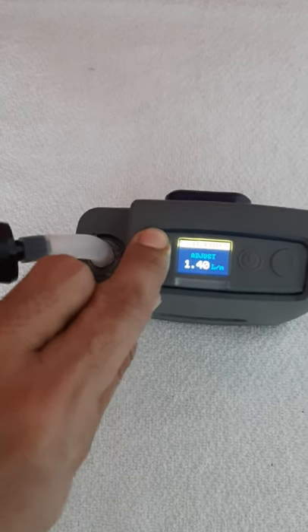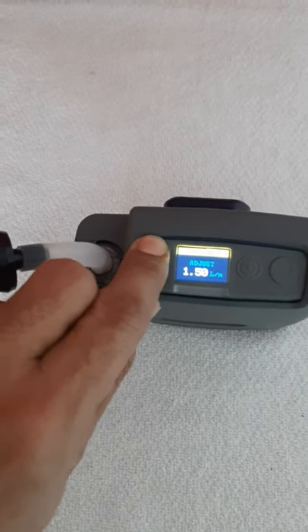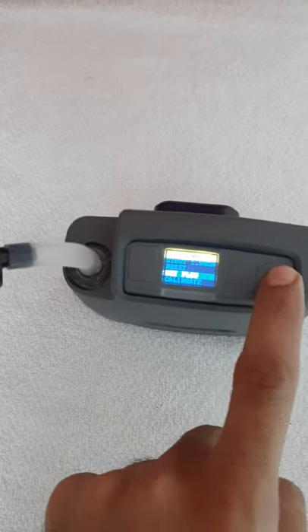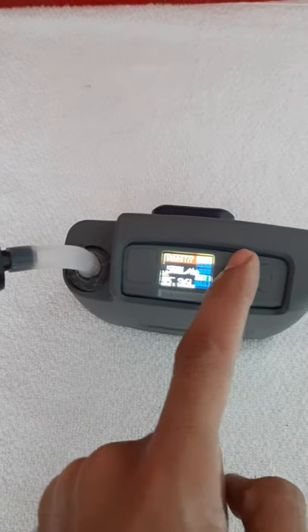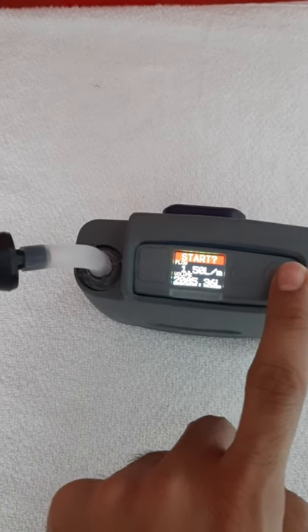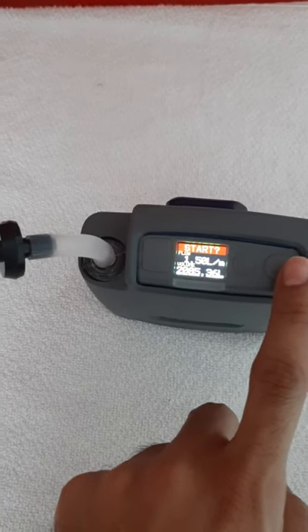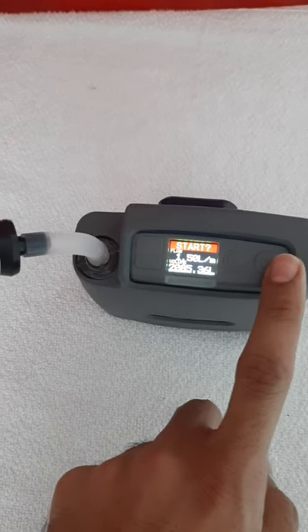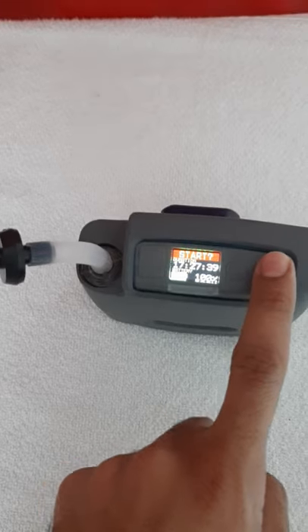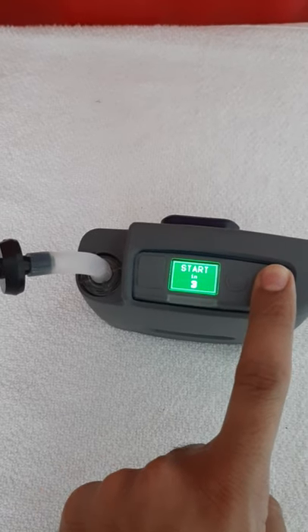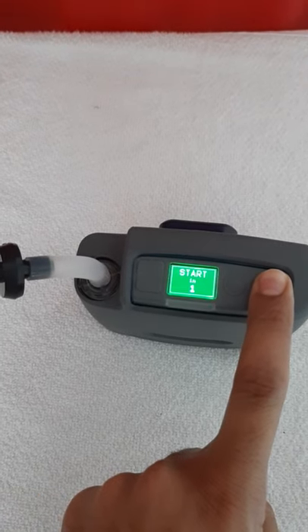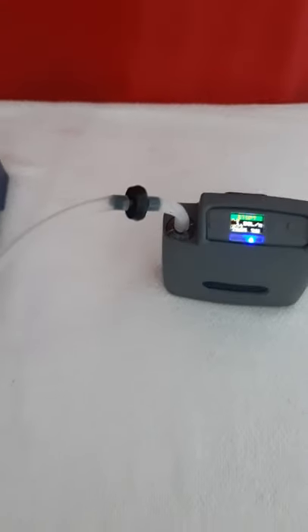I'm going to keep it at 1.5 liters because I'll adjust it through the flow adjuster that I have. I will turn on this pump now, so this pump is now up and running.